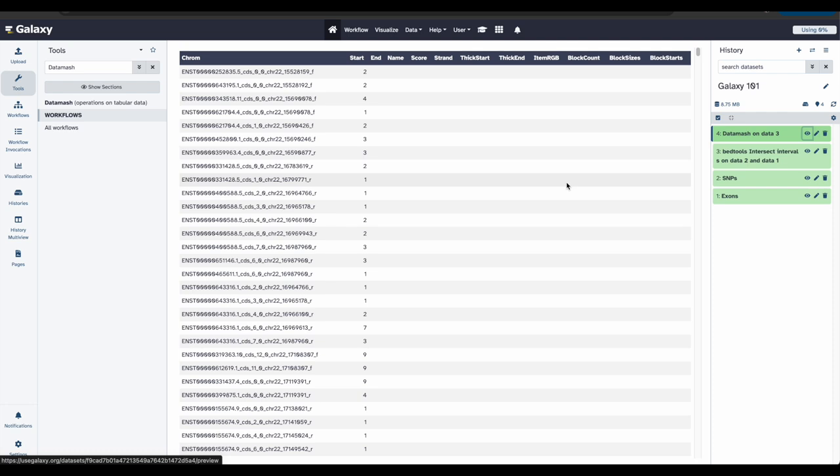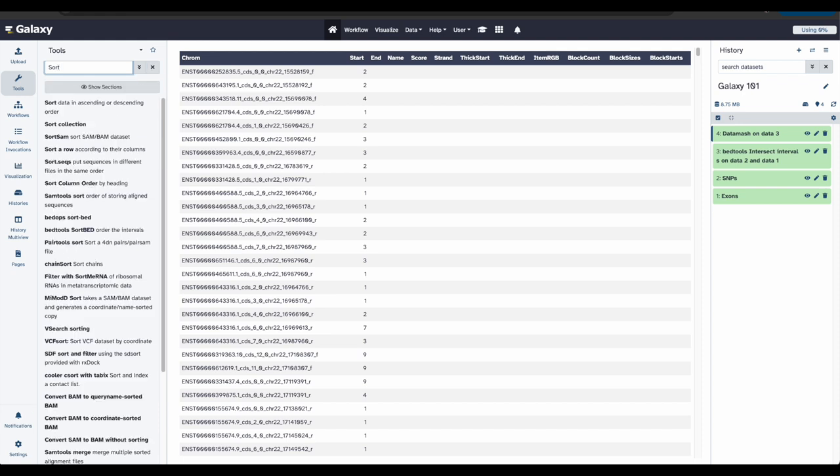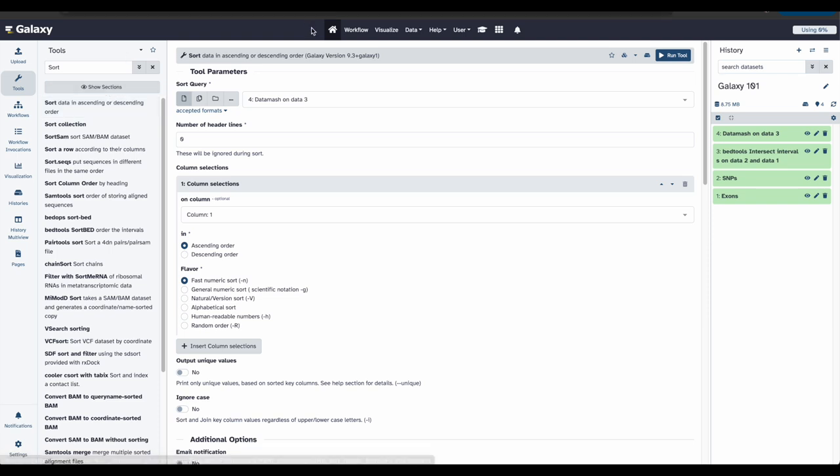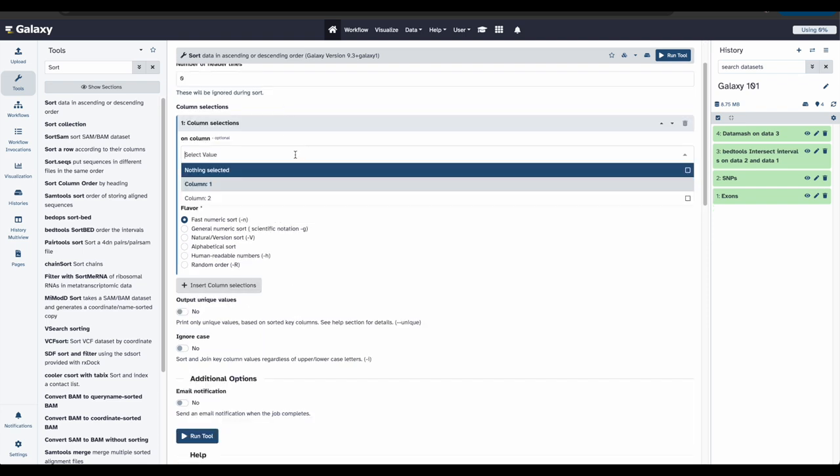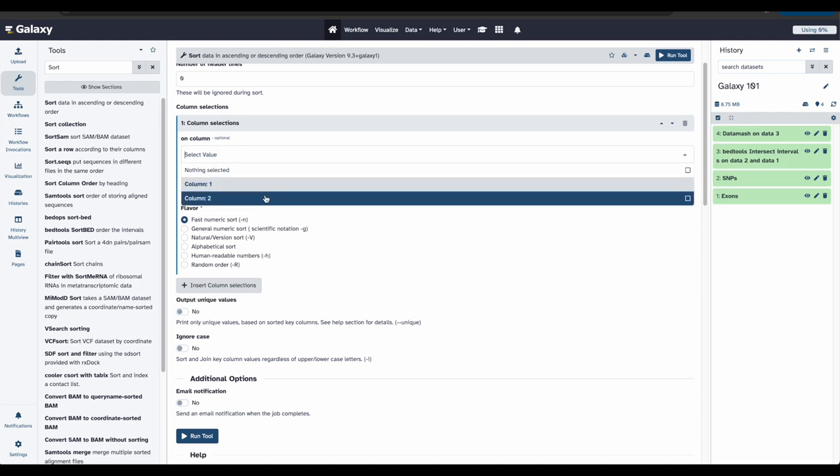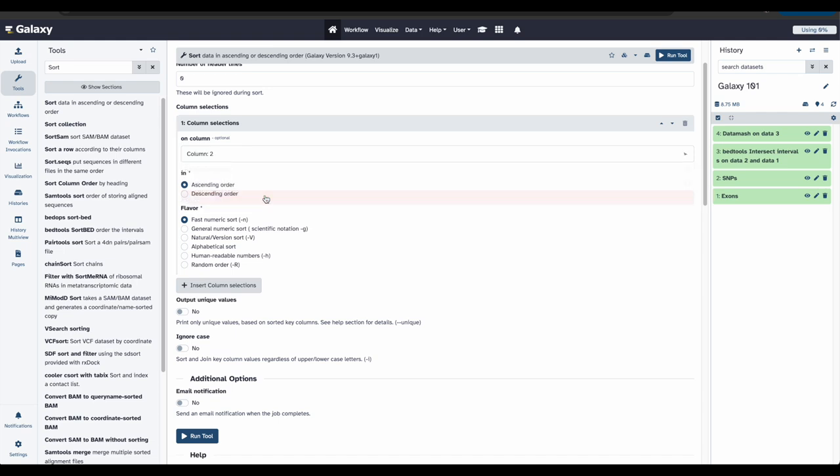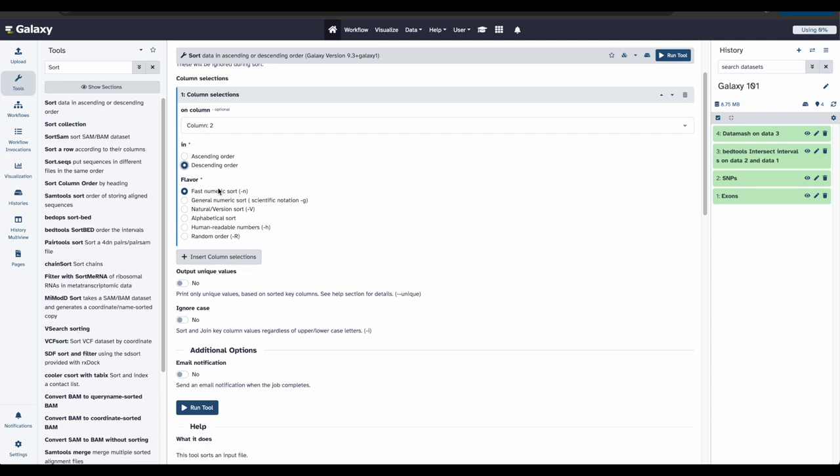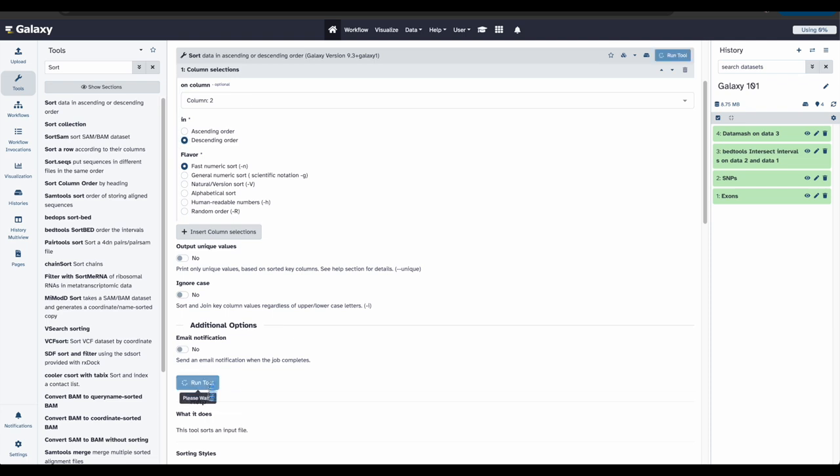Now that we have a list of all exons, and the number of snips they contain, we would like to know which exon has the highest number of snips. We can do this by sorting the file on the second column. Back in the tools section, let's search sort. And select sort data in ascending or descending order. Next to sort query, we want to make sure we have that most recent file, which was our data mash file. Under column selections, we're going to select column two. We would like this to be in descending order. And it's going to be a fast numeric sort. Now click run tool.